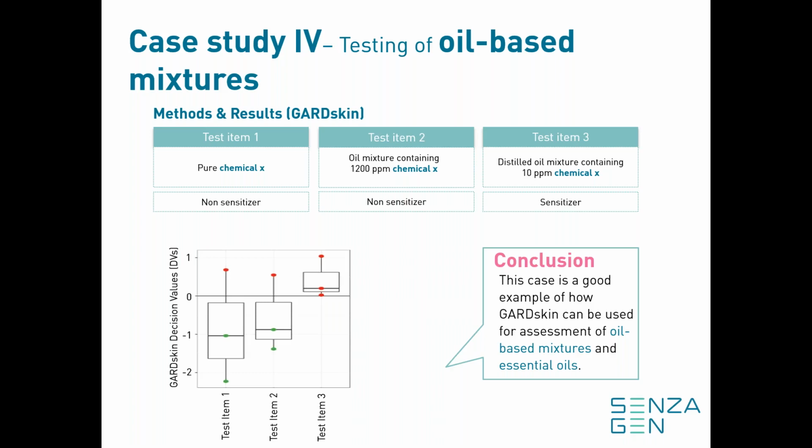So I think this is quite a good example of how you can use the GARD assay for quality control of different types of production batches, and it also demonstrates that the assay is applicable for this type of mixtures.